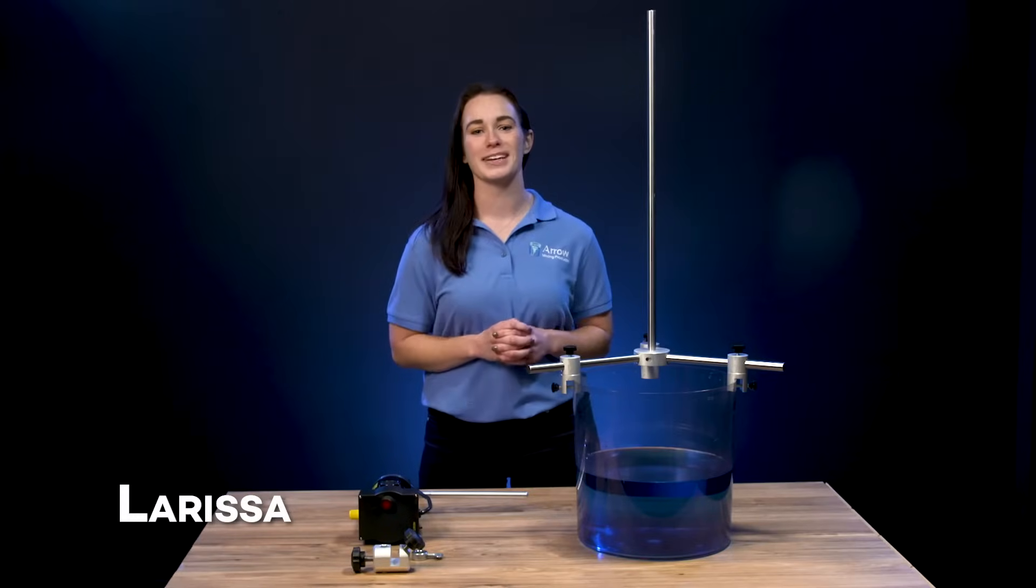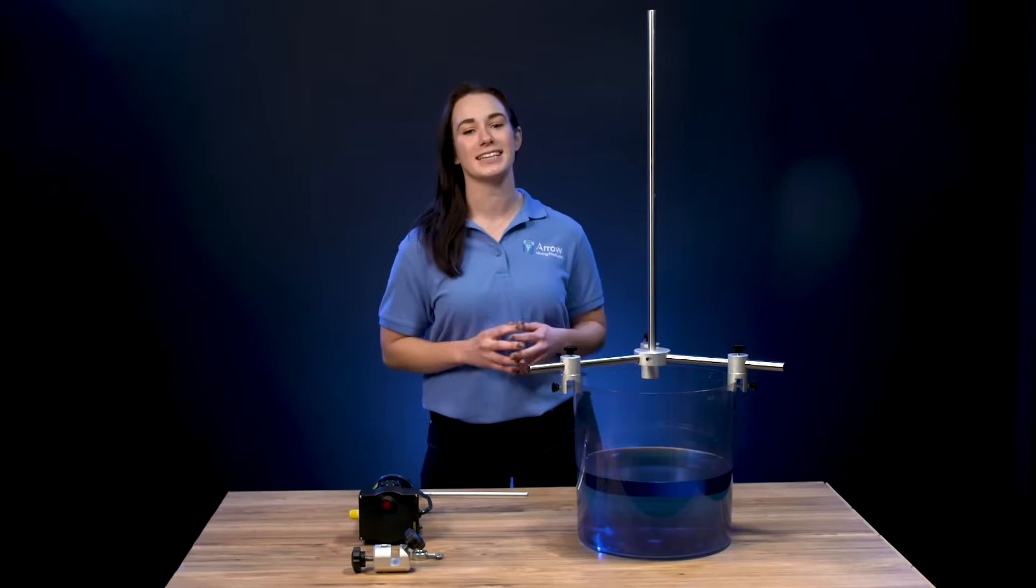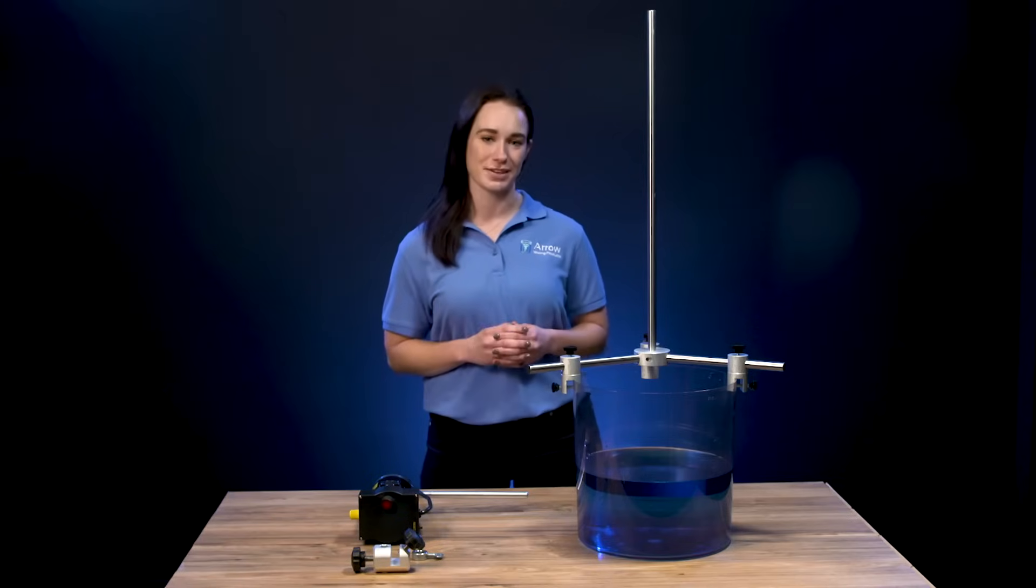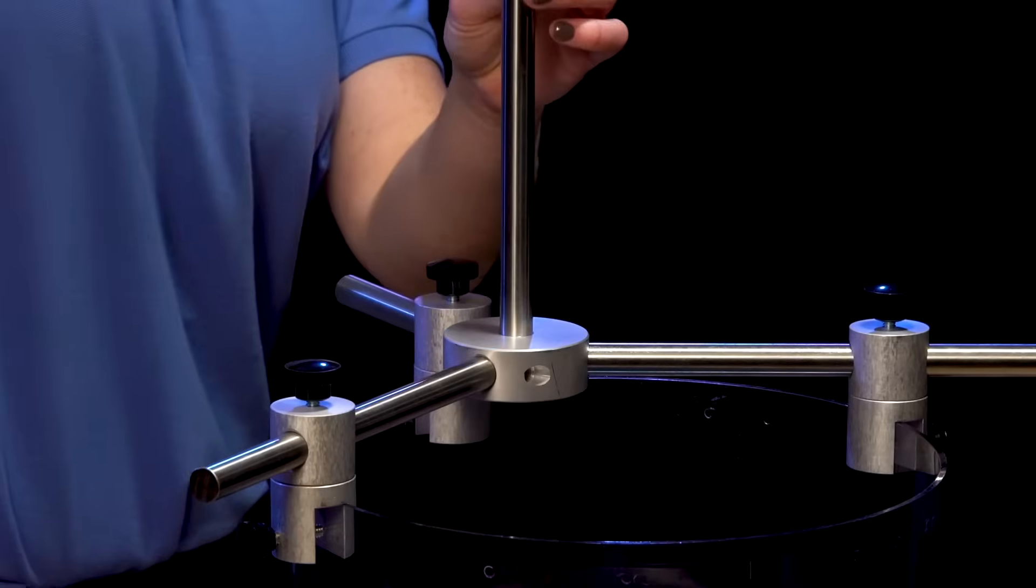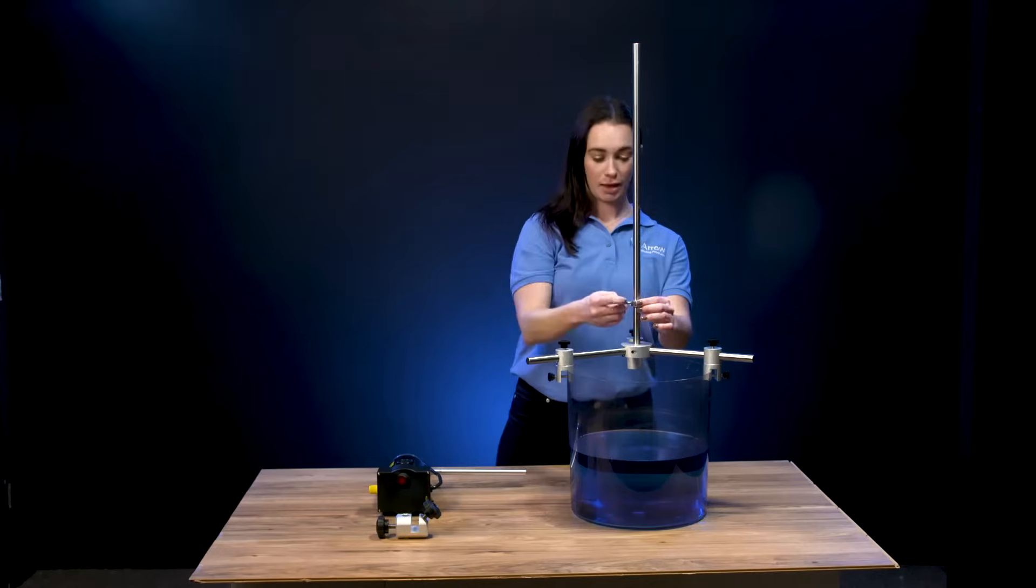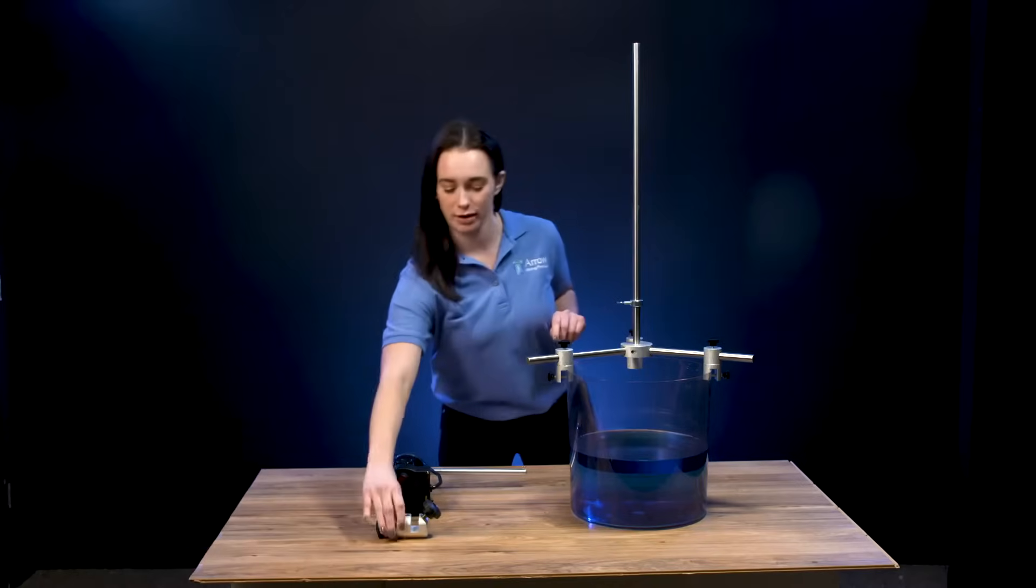This is Larissa from Arrow Mixing Products and I'm going to demonstrate how easy it is to use an Arrow electric mixer. Start by attaching your power hold clamp to the support stand. Make sure to tighten these so they sit securely on the stand.